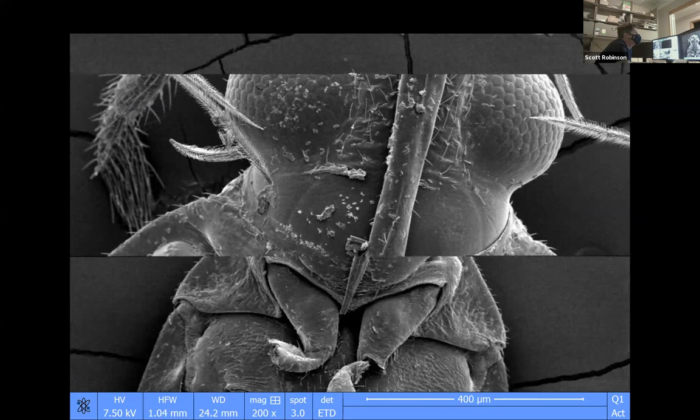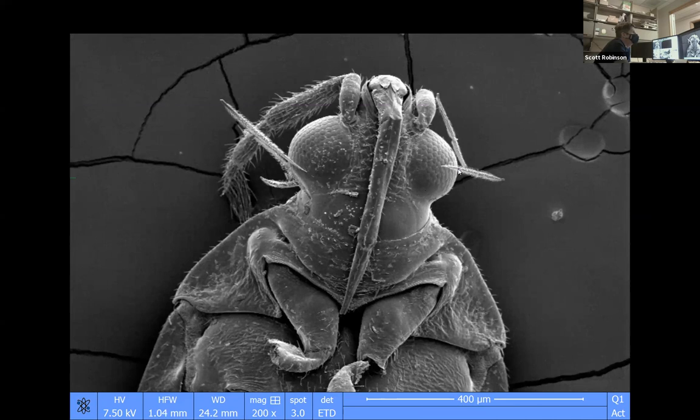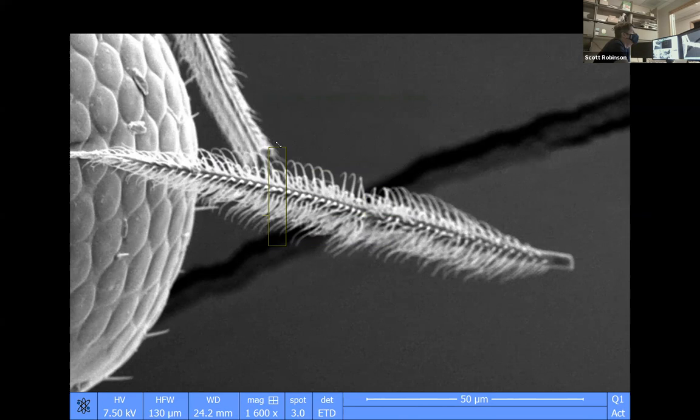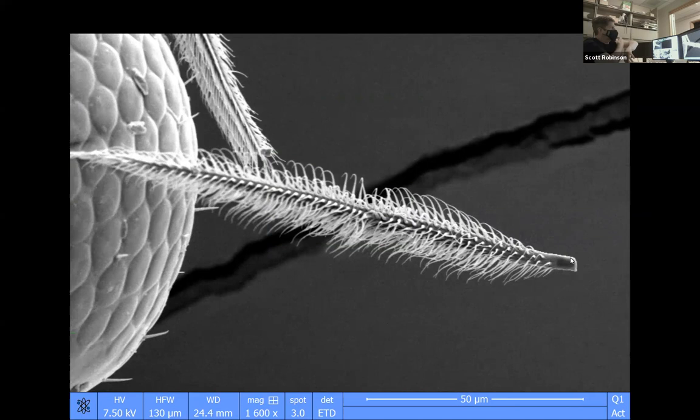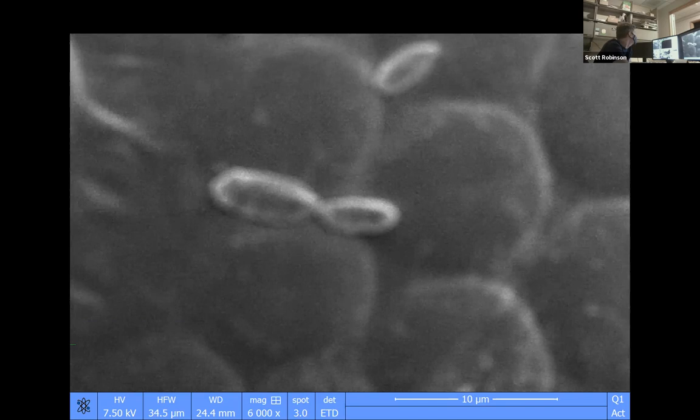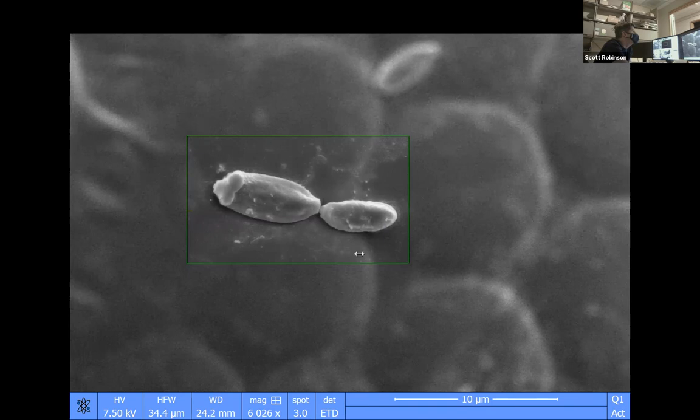You can see the compound eyes, and then you can see these other feathery things, and I'm not sure what they are. This is on the bug still? This is something that's stuck to the bug, but not part of the bug. Cool. So you can see it may have come from the spider. You can see that the base of it is sticking out there. I'm pretty sure these are a form of mold spores.